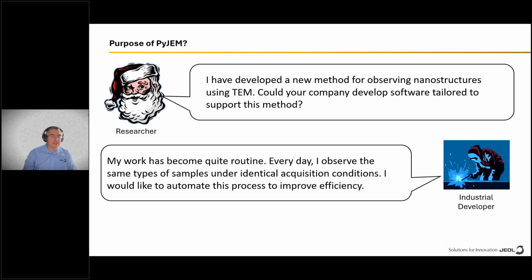If you are an industrial developer, if your background is pharmaceutical manufacturing, quality control, things or areas where you require the same routine to be executed again and again on the microscope, for example, for validation purposes, or as mentioned before, for quality control purposes, then you may want to write a Python script that will act as a recipe.